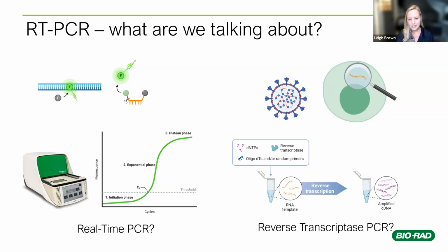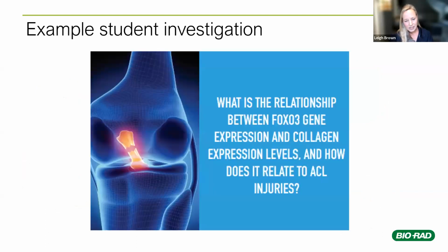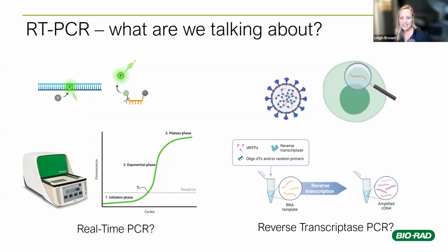So whenever you see RT-PCR, someone's talking about it, you might want to just make sure that in your mind, you know what they're talking about, or you might want to get some clarification there, because both of these are very commonly used abbreviations for both real-time PCR and reverse transcriptase PCR. Because of this, I think most people, and I know for sure at Bio-Rad, we're moving towards using qPCR instead of real-time PCR, but old habits die hard, and so you'll still hear real-time machines, real-time thermal cyclers, real-time PCR instead of quantitative PCR. But the reason for that movement is to do some disambiguation here.